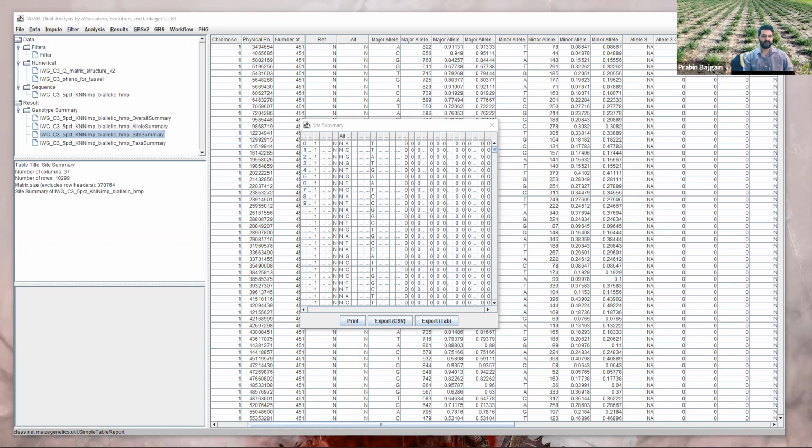Let me find the zoom here. There we go. Let's see, I'm gonna. Oh, maybe I cannot. I don't know. I'm very bad at zooming, guys.